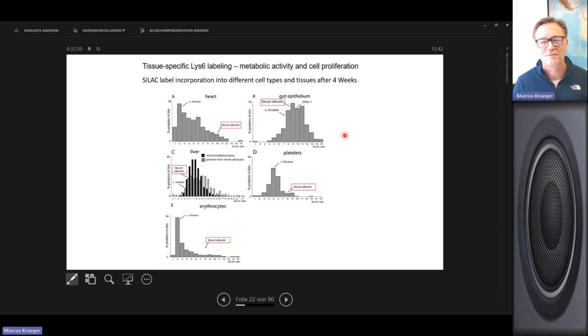I don't know whether this answers the question, or this guy could also say something now. Whatever. Thanks a lot. Okay, we might discuss it later again, right? Okay, so now, but this is definitely a drawback, and therefore people like label-free quantification, right?